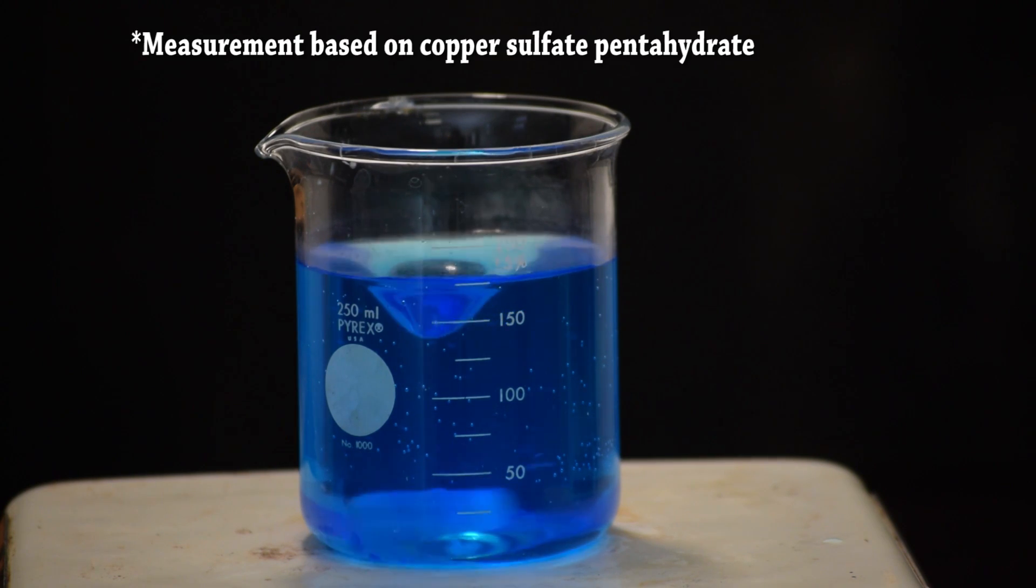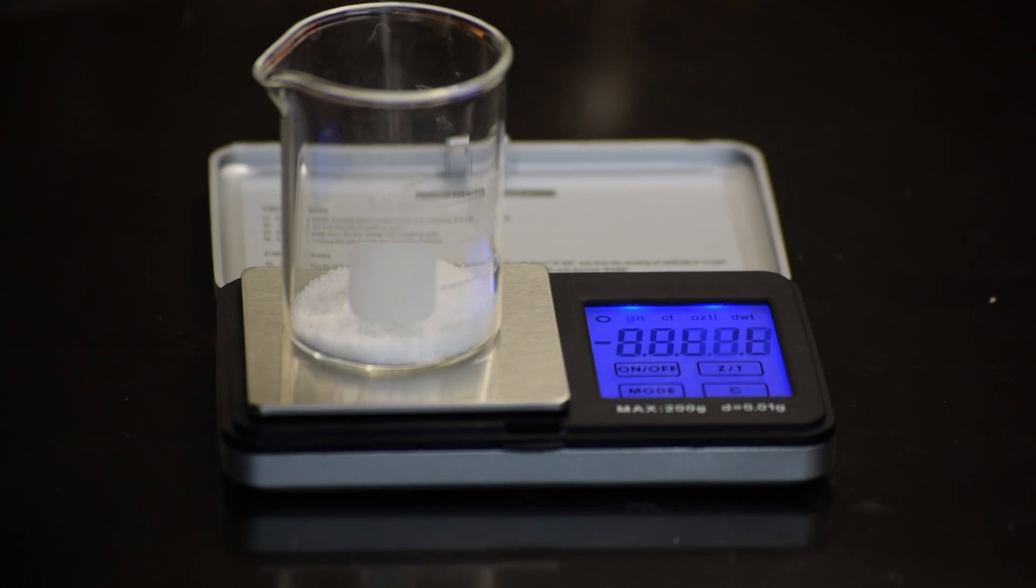First I dissolved 25 grams of copper sulfate in water. Then I measured out 10 grams, which is a slight excess for this reaction, of sodium hydroxide.